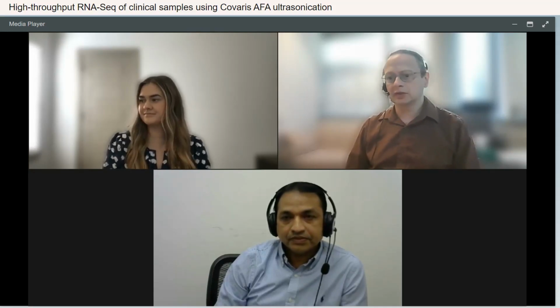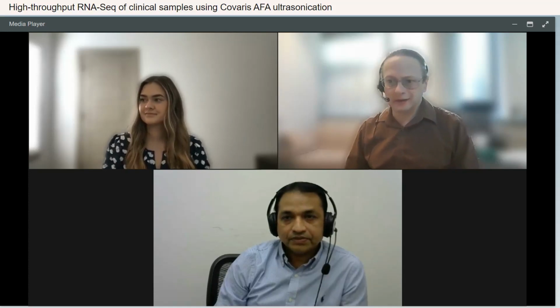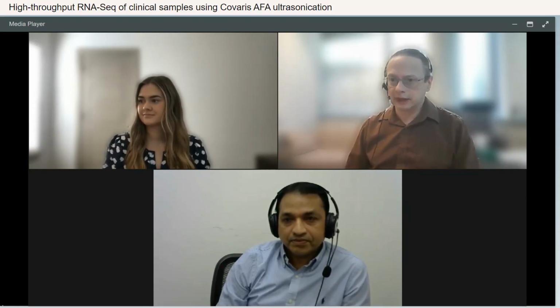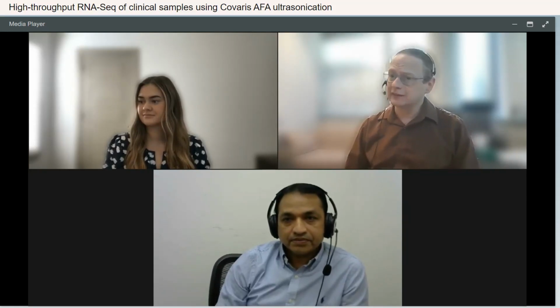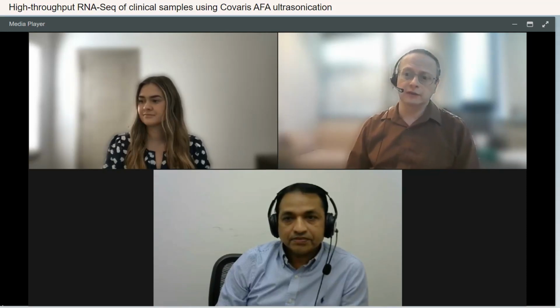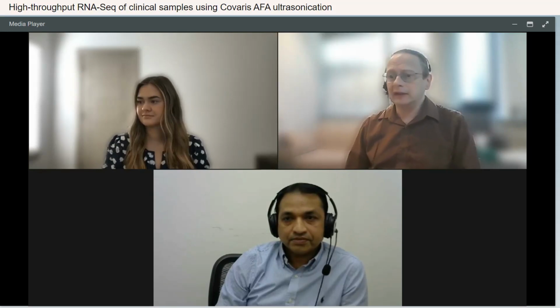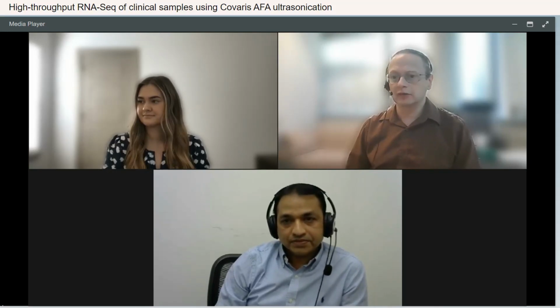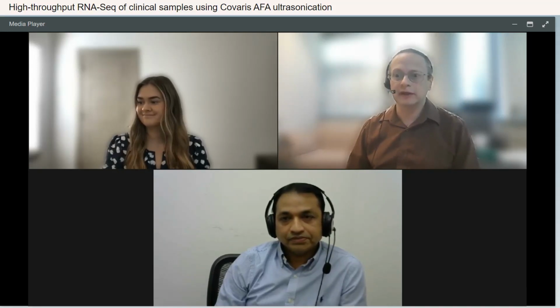Beyond that, I was hoping to show that the quality of the RNA-seq data is very similar to the quality that you get using cationic fragmentation. Is it better? Is it worse? It's a very hard thing to say because it's very hard to end up with a gold standard for any of the bulk RNA-seq methods. Any of the different RNA-seq methods are going to have different noise parameters, and that results in clustering quite separately. So it's kind of hard to know exactly what the gold is. The same is going to be true for qPCR. That's not a true gold standard once you're trying to get an absolute value.